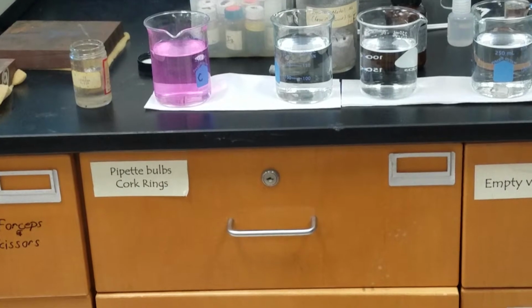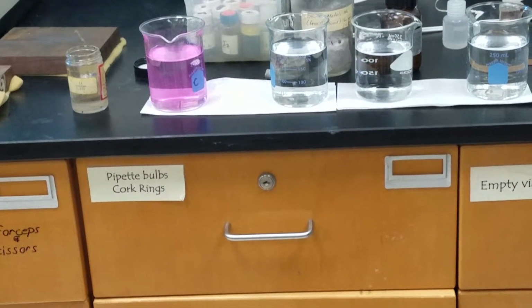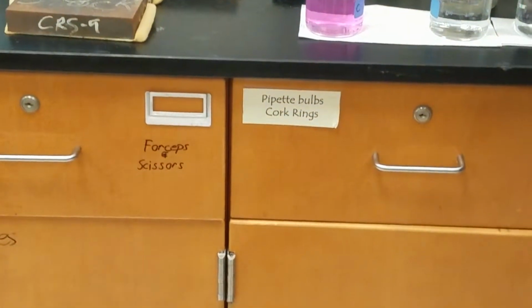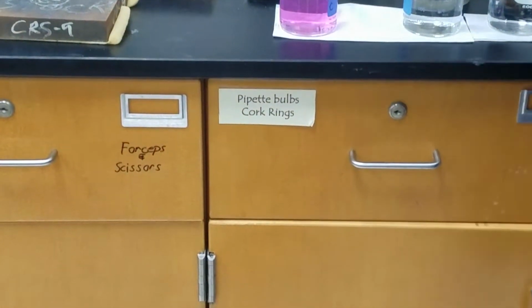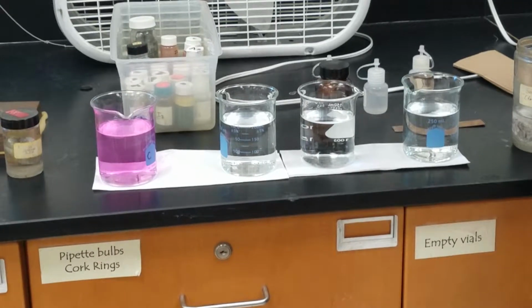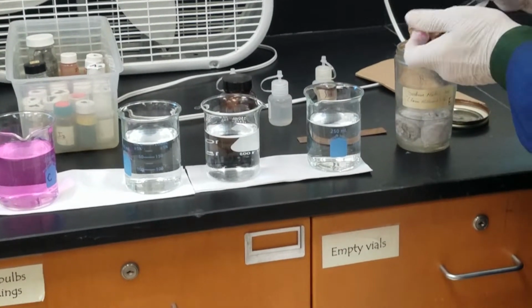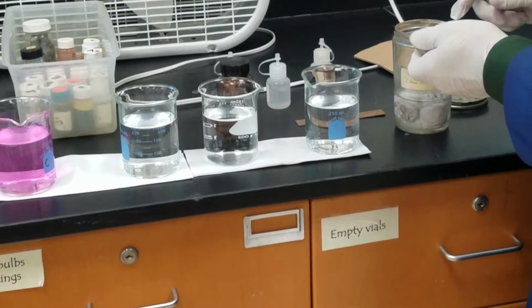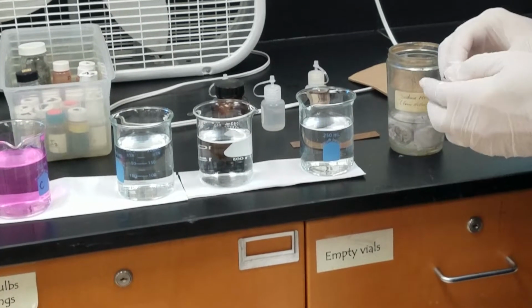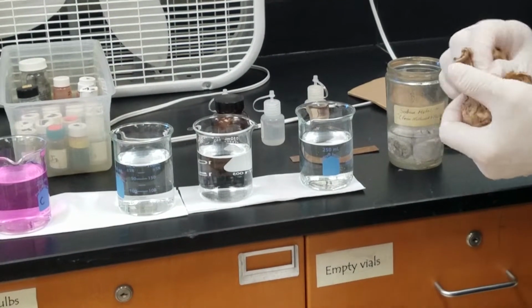So as we go on the board from lithium, sodium, potassium, what happens to the size of the atom? It gets larger. I'm going to go ahead and put this back in here. And then we'll take a look at it. Sometimes if you get too big of a chunk, it can pop out, and so now you would have molten lithium or molten sodium flying through the air at some poor person.